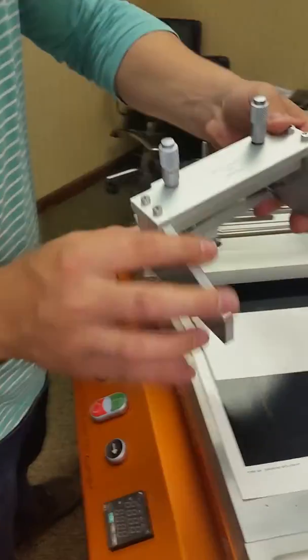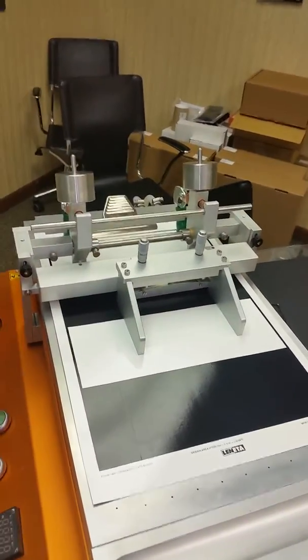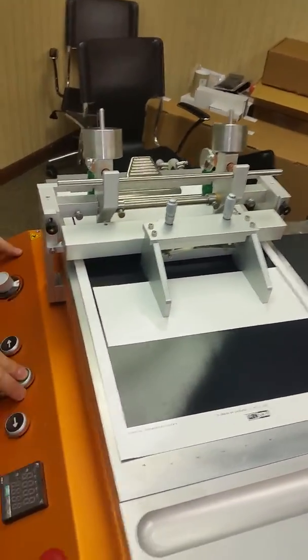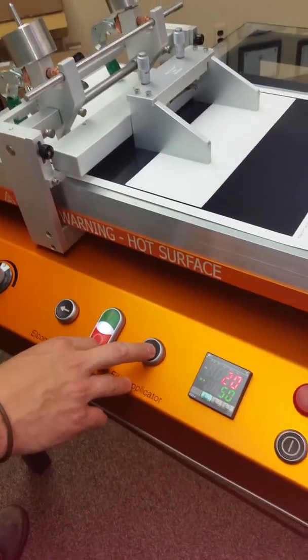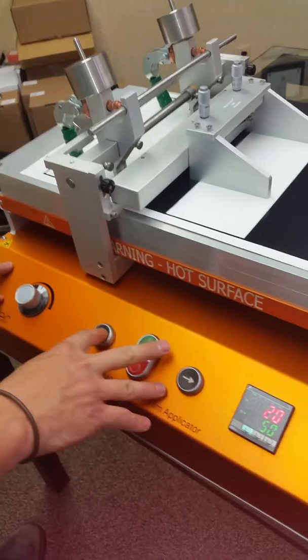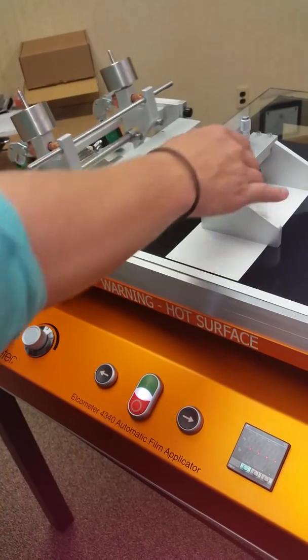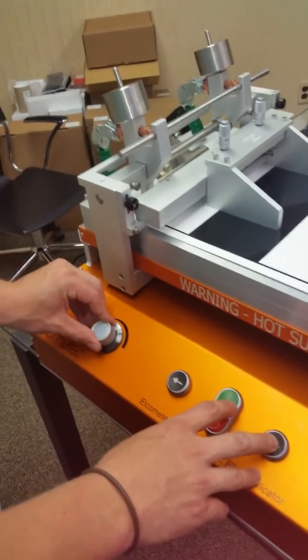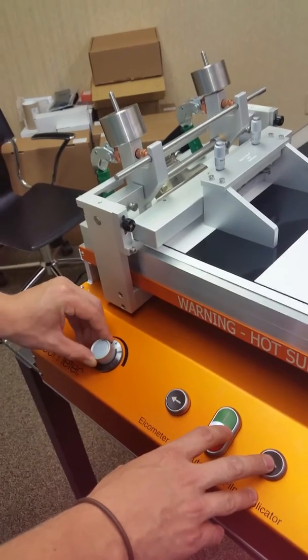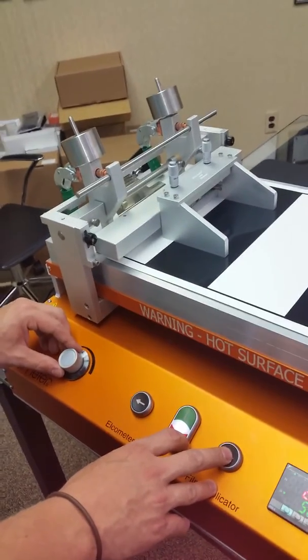This is the 3580 casting knife that we're using in this demonstration against the push bar. We'll turn the unit on and put it back to the beginning. You can adjust the speed which you wish for it to travel down the table. We'll do a slow speed first and a faster speed next.